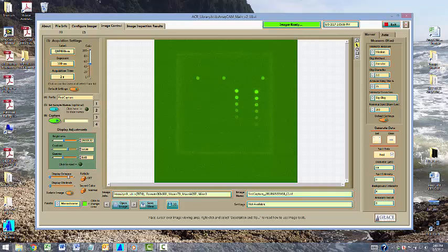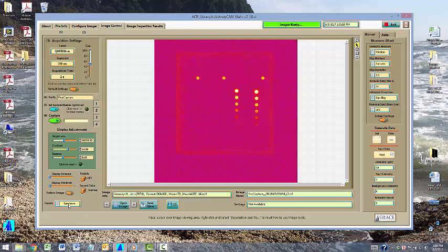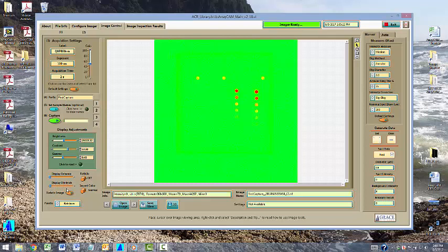There are several palettes available to choose from. For example, we could have chosen the Gradient palette, which uses color to increase contrast, or Spectrum, or Rainbow. The display adjustments work the same way for every palette.